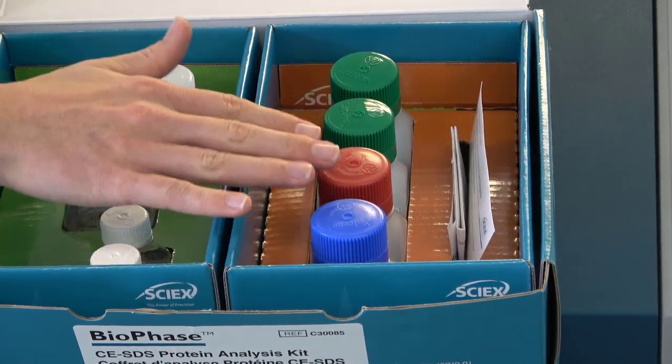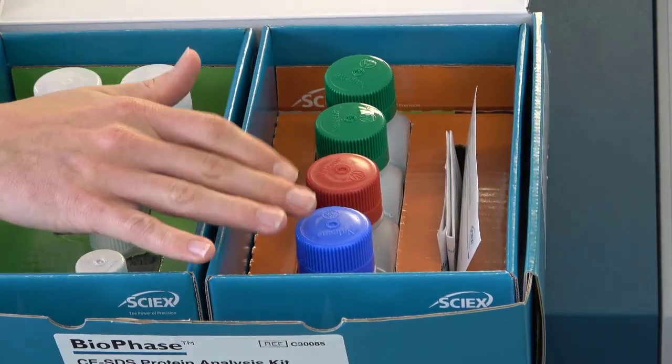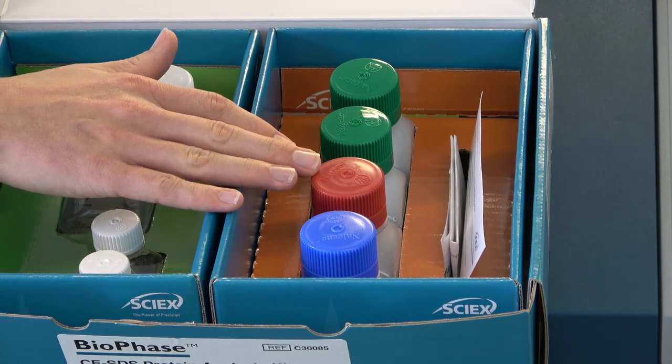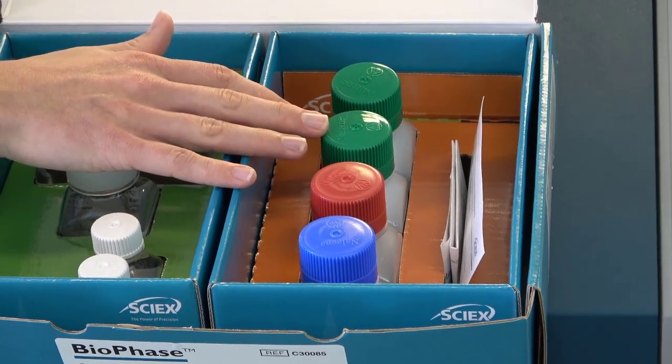You also notice that we have different colored caps. So each reagent has its own colored cap. Our basic wash has a blue cap. Our acid wash has a red cap. Our gel buffer has a green cap. And that's definitely by design.